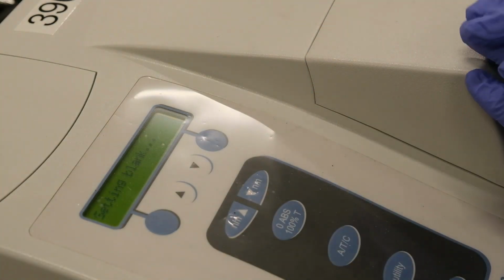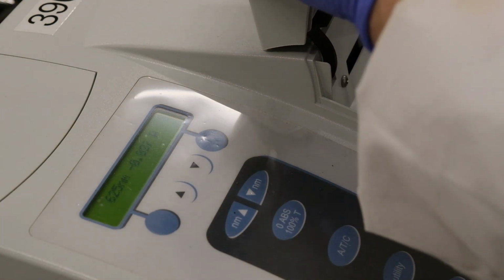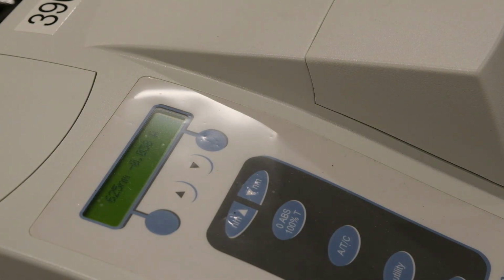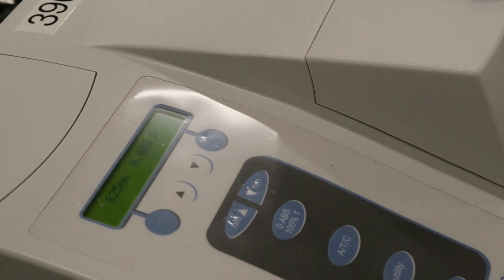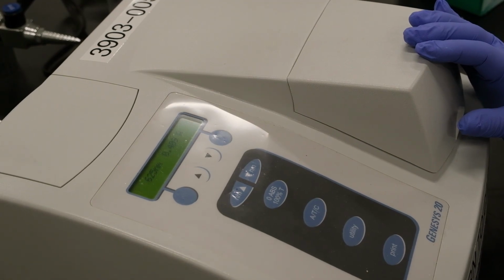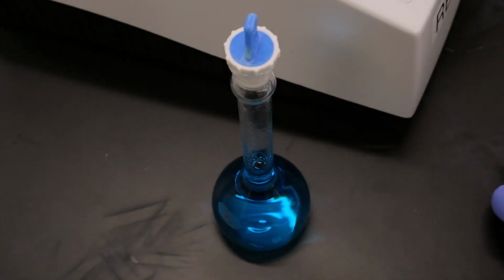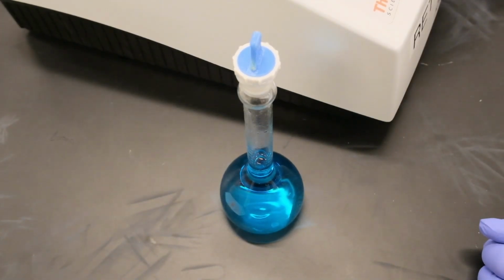Now 5 nanometers below. And based on that, we choose which one is the correct wavelength of the solution that we prepared using the 3 milliliters of brilliant blue.